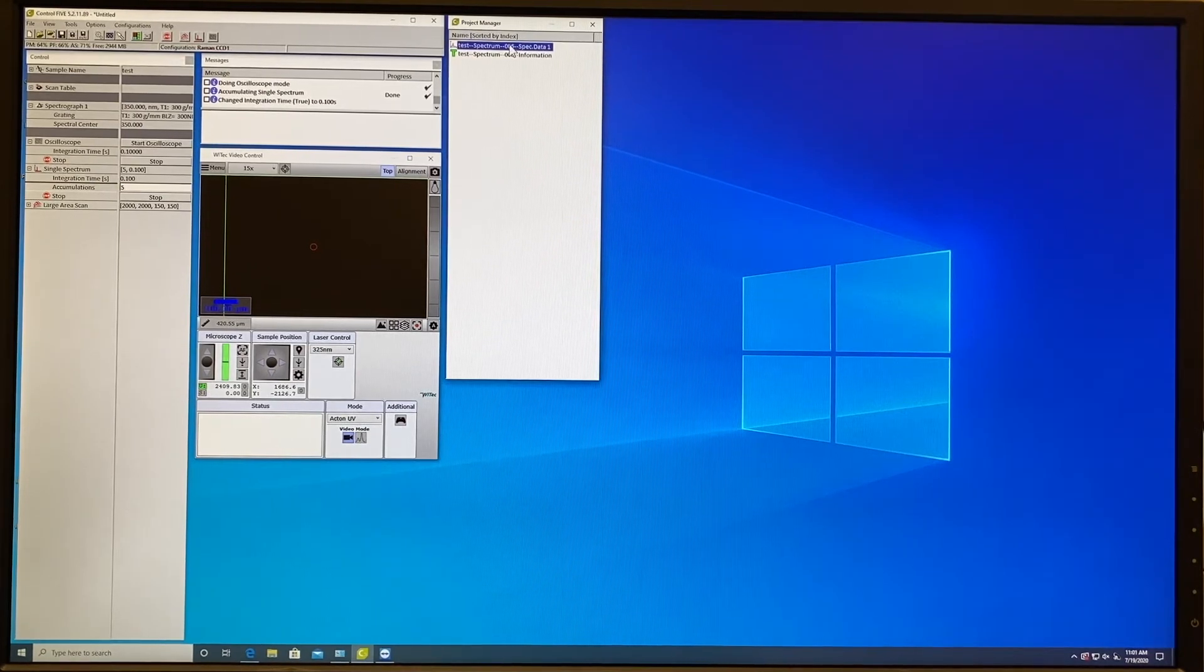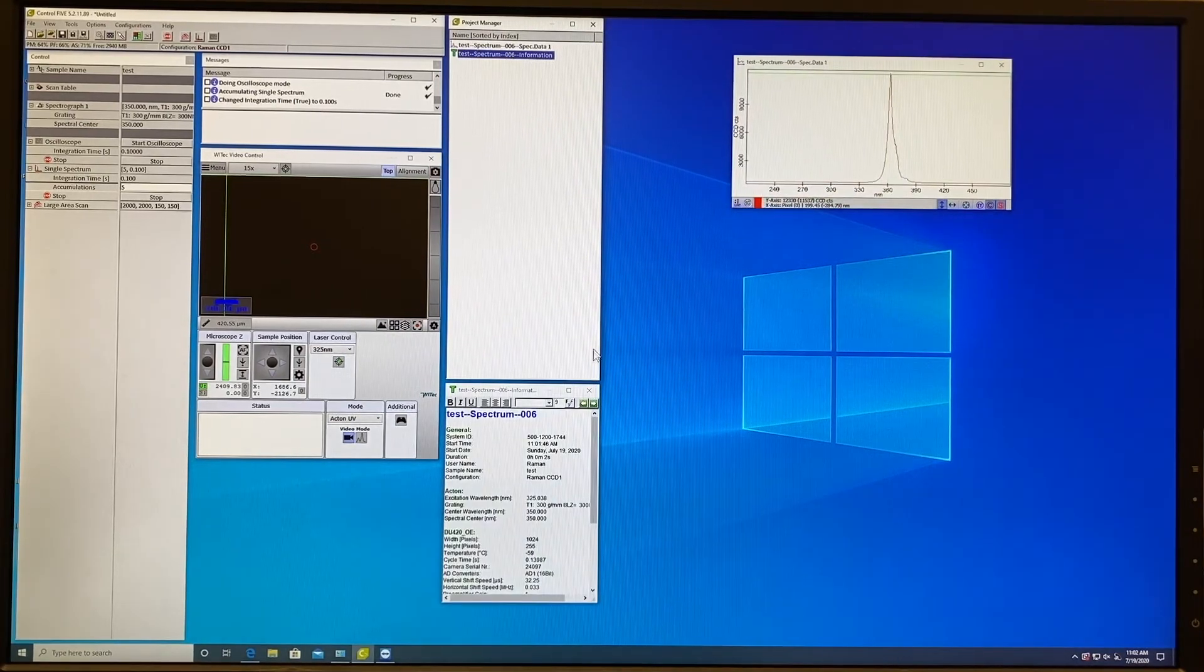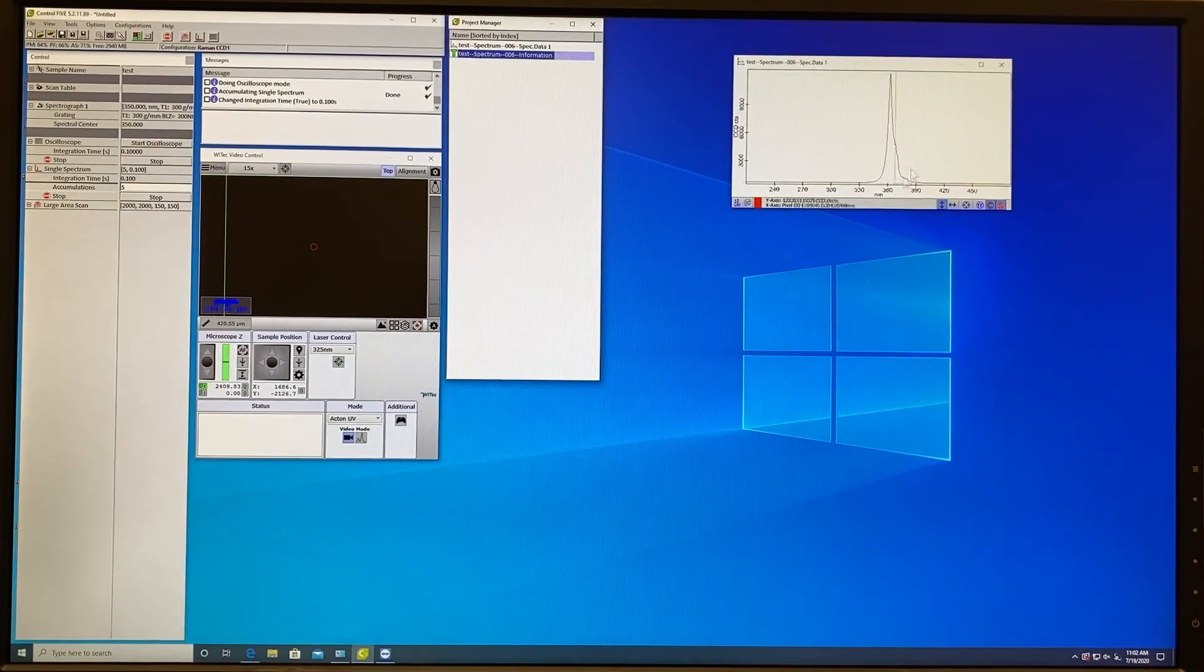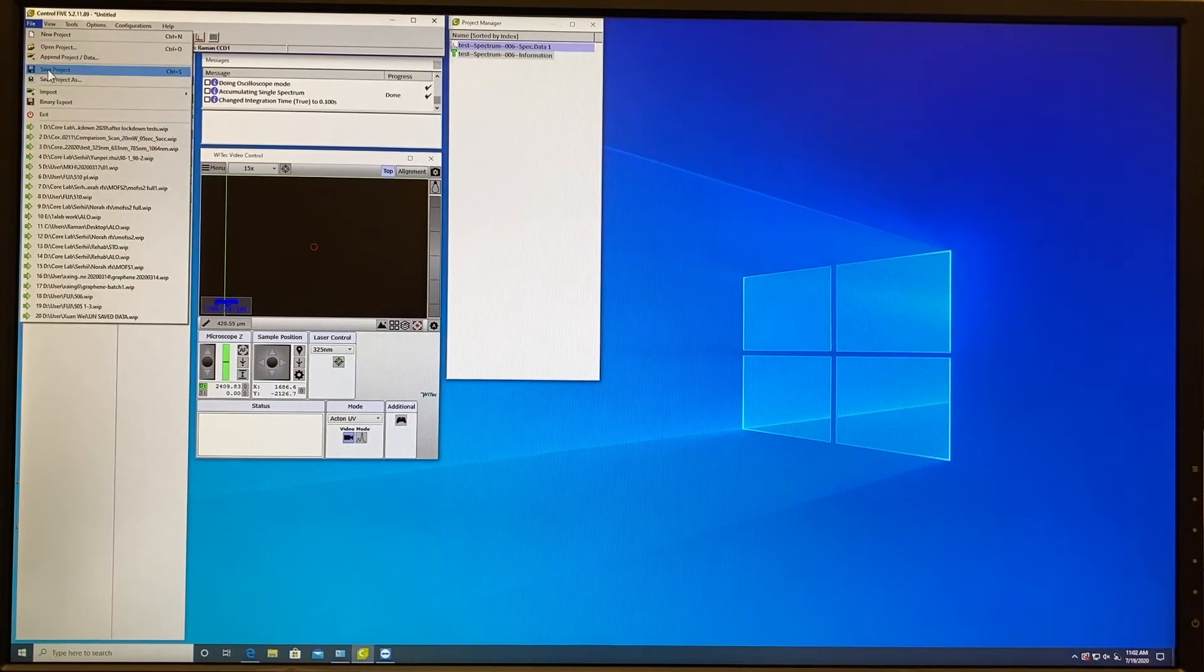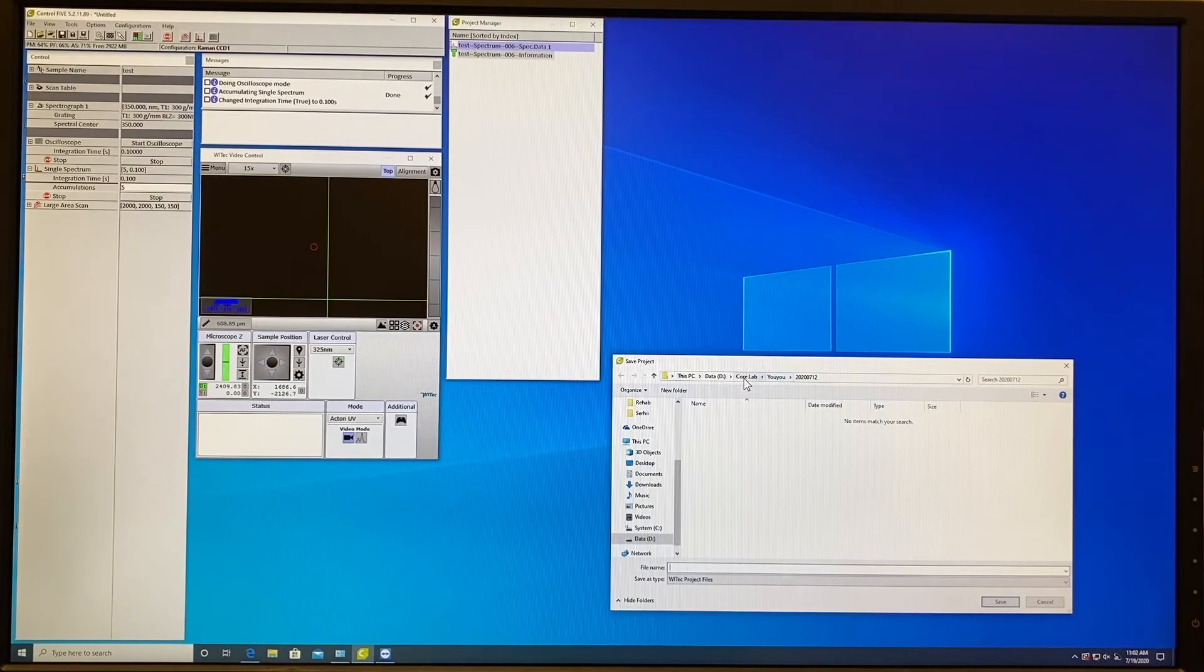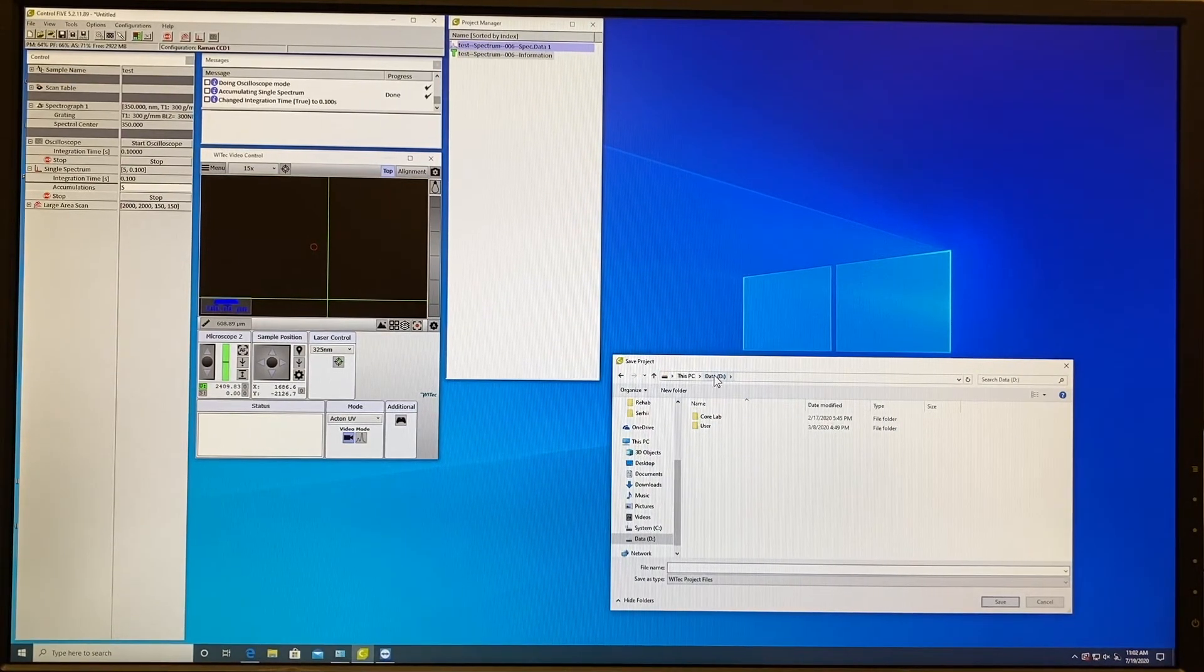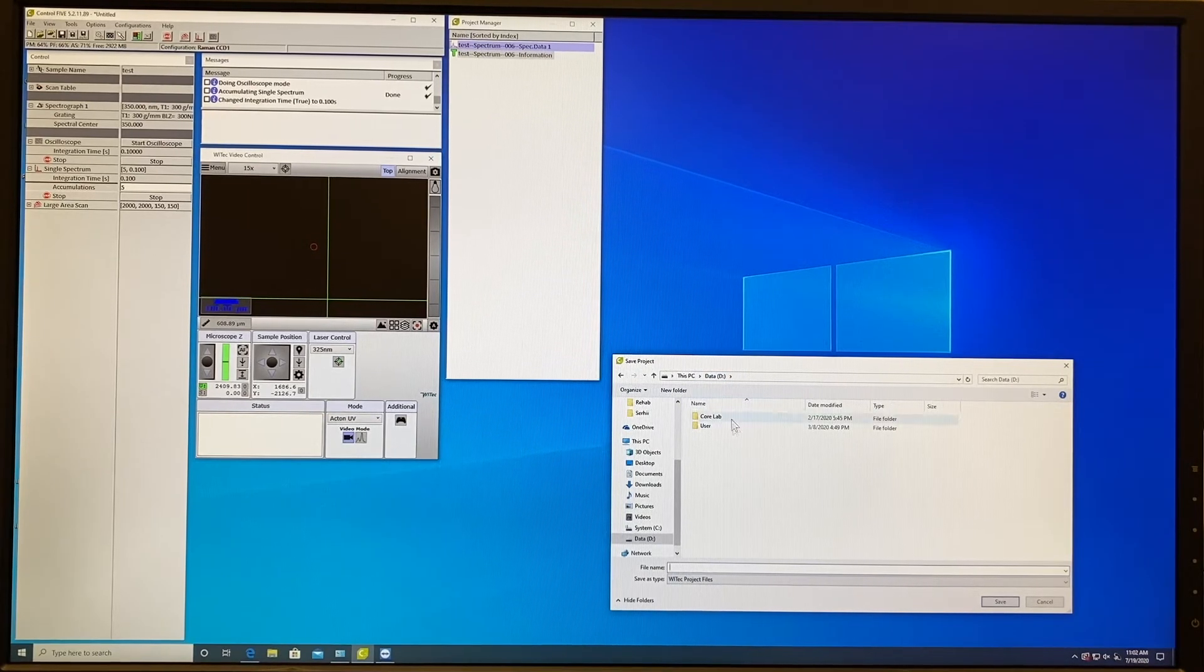Once the spectrum is accumulated it will appear in Project Manager. You can review your data as well as the information file. To save the project you go to file, save project as, and you go to your folder in the data disk.